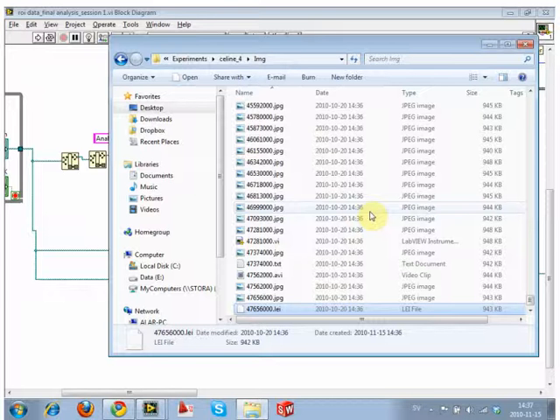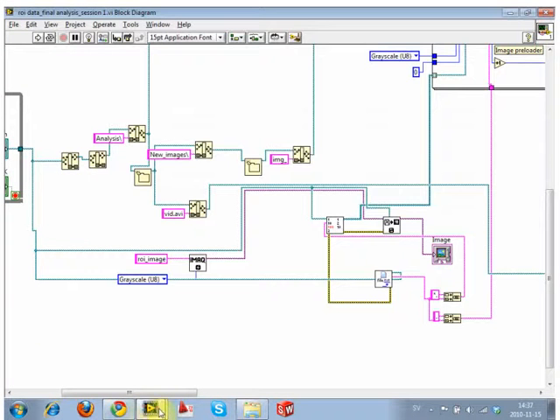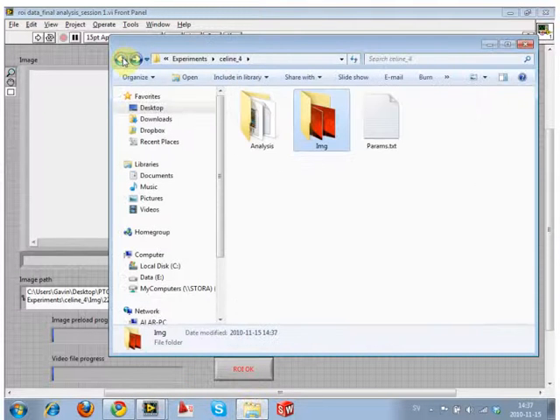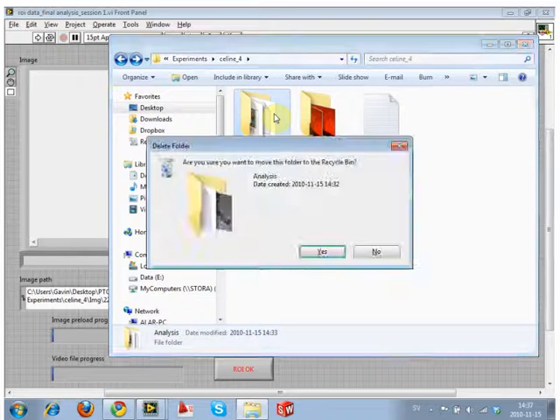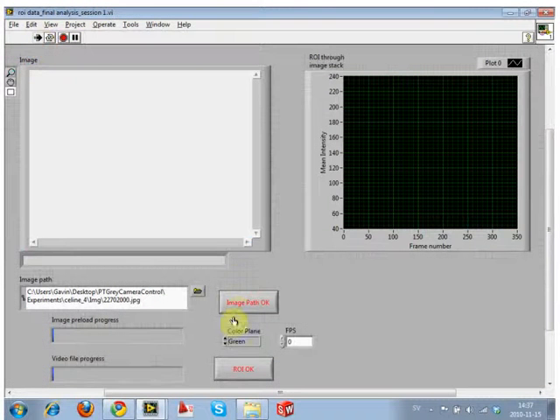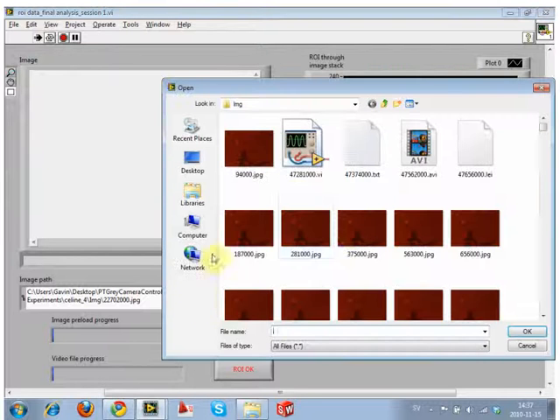So if this is an example of your data set, then if we chose, let's delete the analysis file. So, we've got all these random files here, okay? By choosing this file, we're saying only use JPEGs. That's the only prerequisite we have on this data. All we're doing is saying that these are the files, ignore them, because they're not .jpegs.